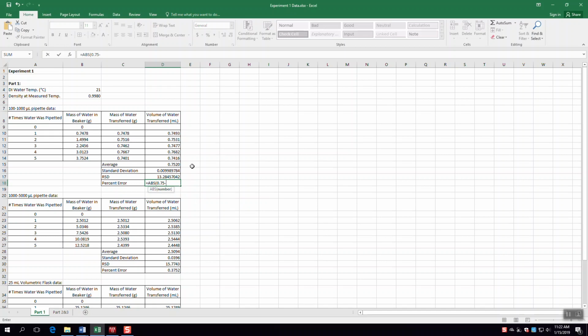During your experiment, you'll notice that each of these numbers is going up for you by about 0.5 and for me by about 0.75. But it's very easy to make a mistake when working with a pipette or in lab when you're talking to your lab partner and you forget what's going on. So let's say during the course of the experiment I look down and this number, rather than 3.0123, is more like 4.526. Now, or 5260 rather.